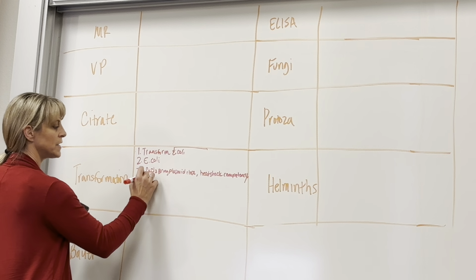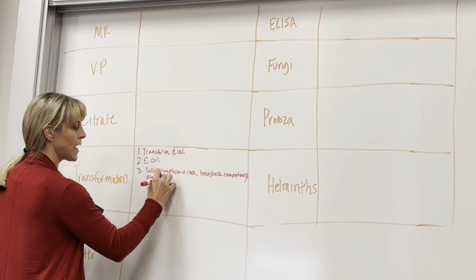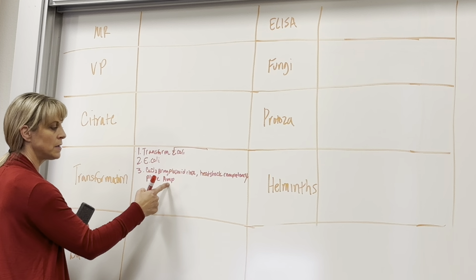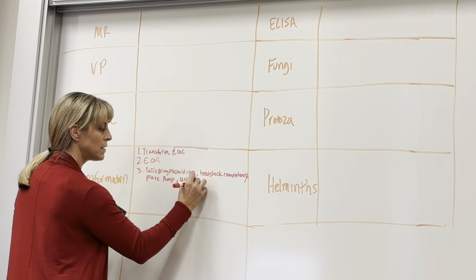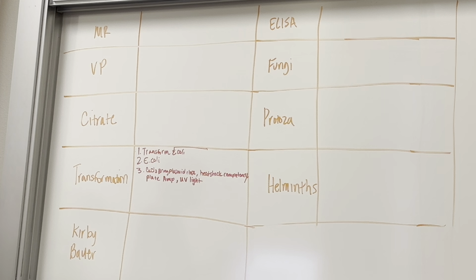Then we plated on an ampicillin plate, which we'll talk about why. And then we looked at it under the UV light. Is that everything we did, basically?